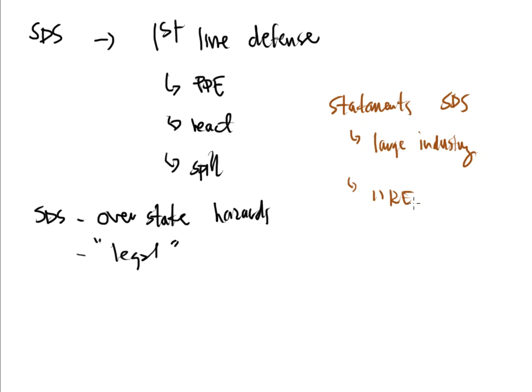So there's always a question. What are the real concerns? And we don't really know. The only way that you can do this is with experience working with the chemical and with time. You're going to have to get acquainted with that chemical. You're going to have to establish a relationship with it before you really know how careful you have to be handling this chemical that you're bringing into a lab. We also saw that these statements can be very general, and that's by design, at least.